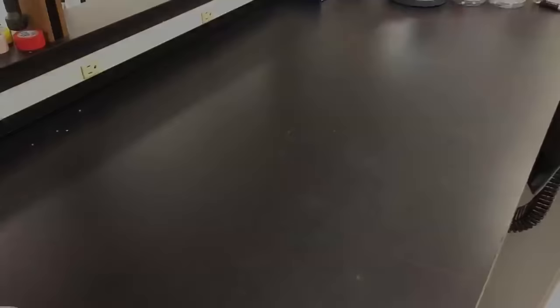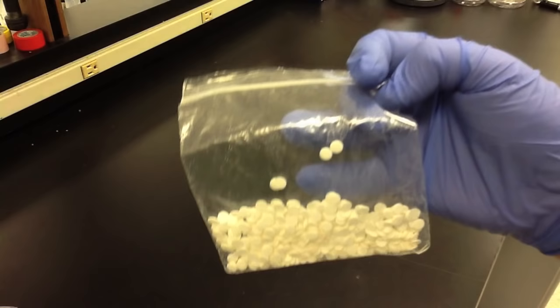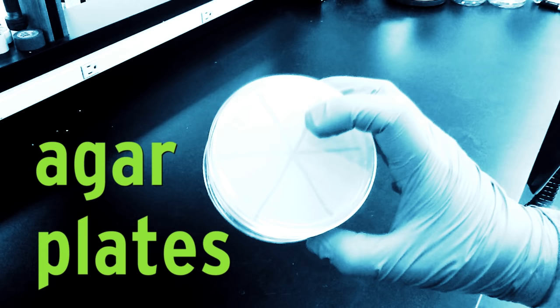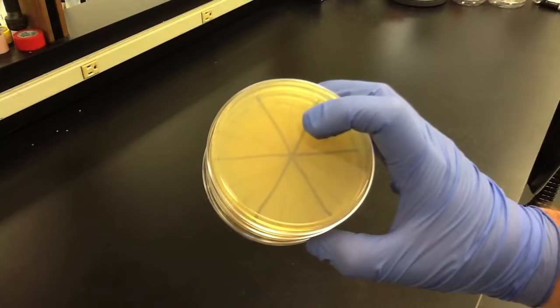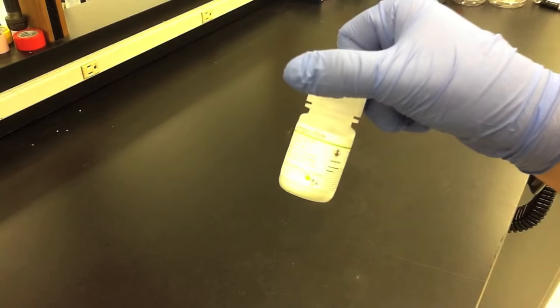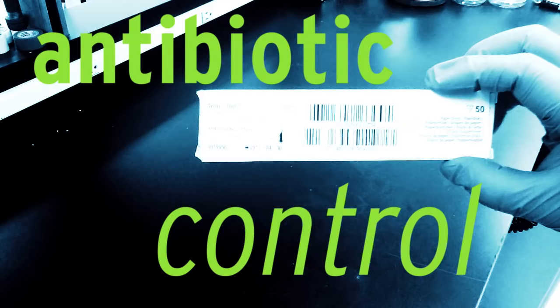You will need 6 millimeter filter paper discs, sterile petri dishes, agar plates with no added antibiotic, sensitive and resistant bacterial cultures, an antibiotic to test, and an antibiotic control.